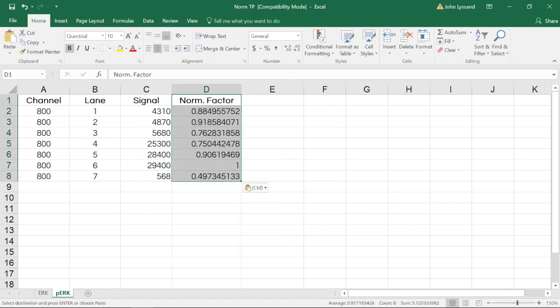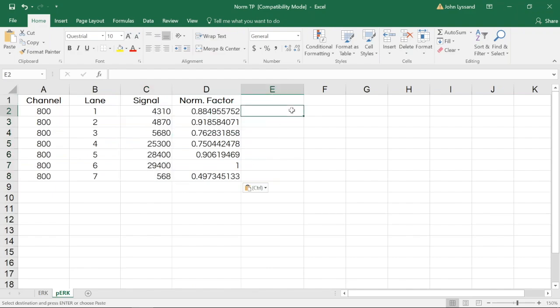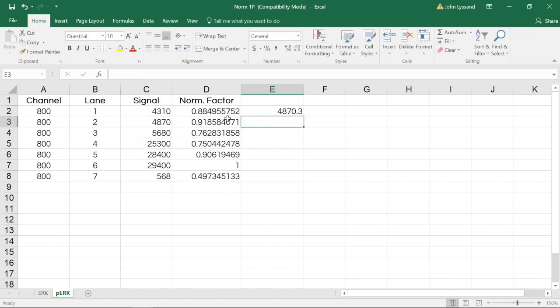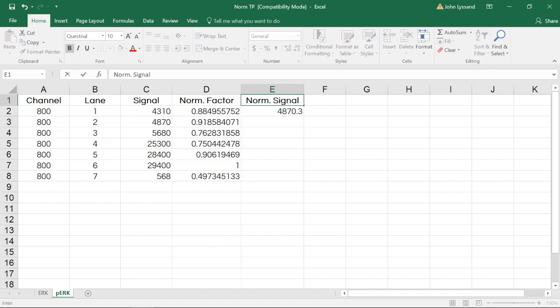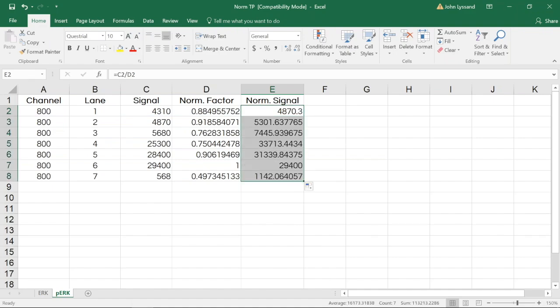Now we'll use this normalization factor to correct our non-normalized signal for our phospho-ERK target. To do this, we'll create a formula in Excel where we divide our signal value by that normalization factor. When we apply that formula, we now have a normalized signal for that lane. That same formula can be applied to all lanes using copy and paste functionality.